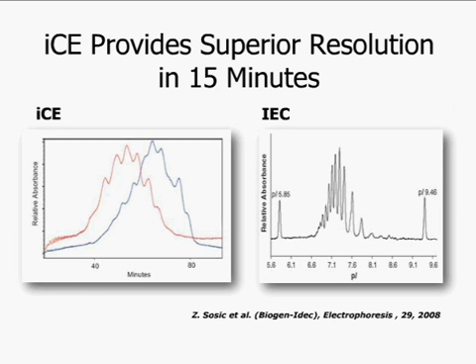In this side-by-side comparison, I do want to take note that if you can switch the labels from ICE to ion exchange, they're actually switched. So the higher resolution separation is the ICE system. It's important to take note that, unlike the surface interaction-based separation of chromatography, the electrical field of CE can also penetrate into the three-dimensional structure of a protein, interrogating differences within the solvated pocket.